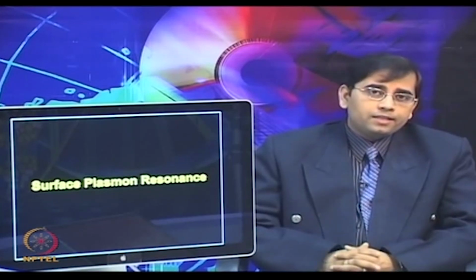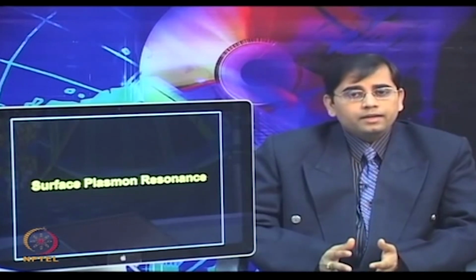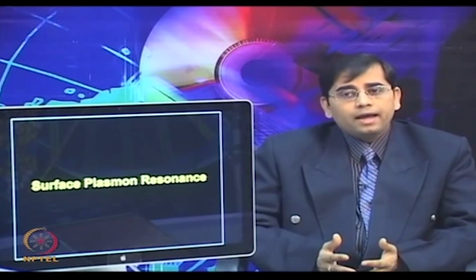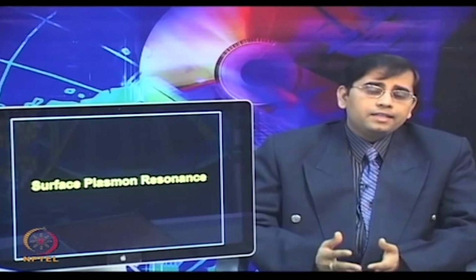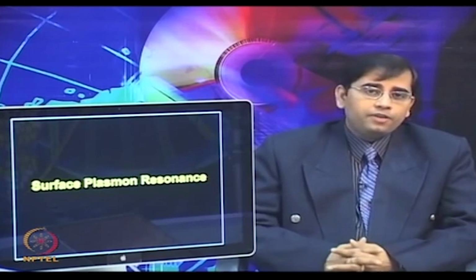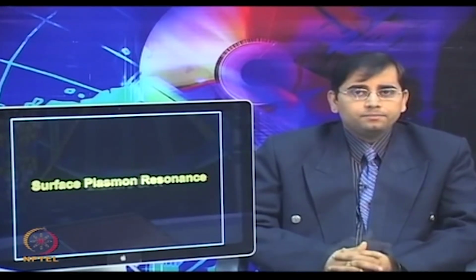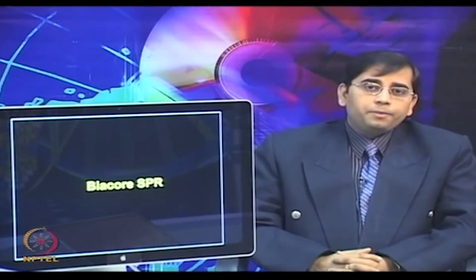SPR biosensors have played a very important role in biological research into biomolecules and their interactions, and now they are increasingly being used for detection and identification of chemical and biological interactions. Now, let us move on to the Biacore SPR technology.